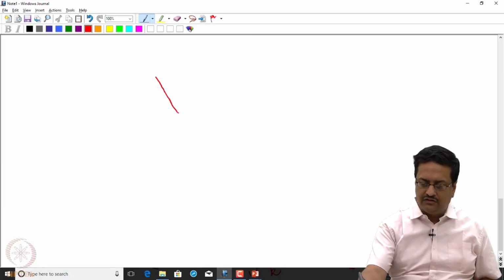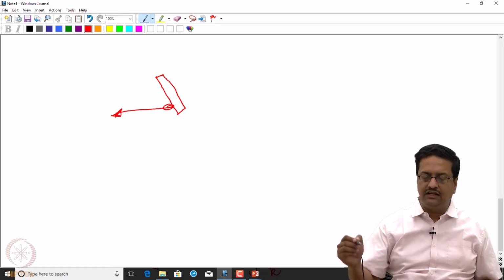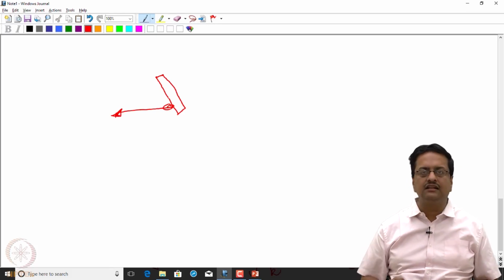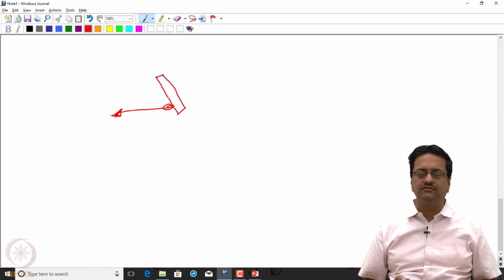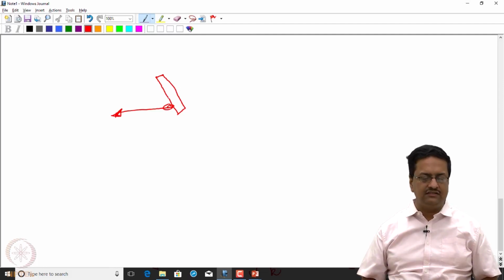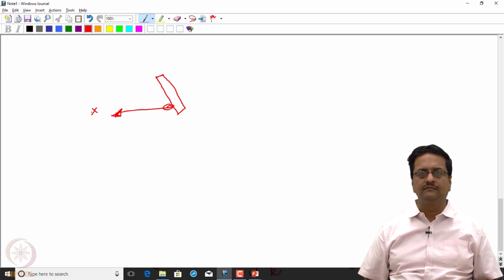An X-ray diffractometer consists of one X-ray generator, which is connected to the X-ray tube, which is placed on a horizontal axis like this, and the beam comes out in this direction. So when the X-rays are generated, the X-ray beam directly comes out of the source, and when we are trying to align or mount the crystal, we don't want this beam to be inside the diffractometer chamber.